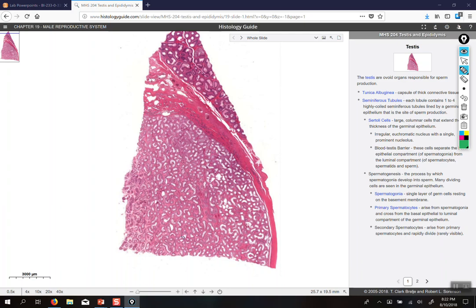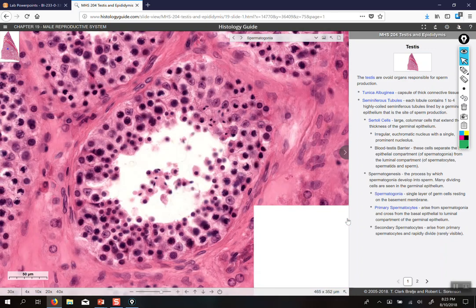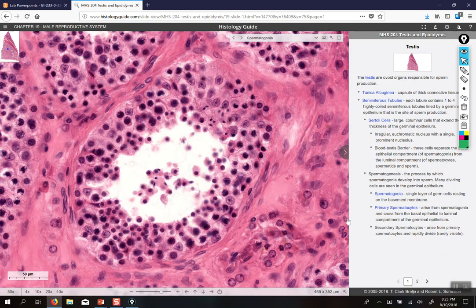So we're going to zoom way in. Maybe I can make that happen automatically by pushing on the link. Wonderful. Oh, this is a good one. You can even see a little spermatozoan right there. Let me get my pen and I'll start pointing stuff out to you.